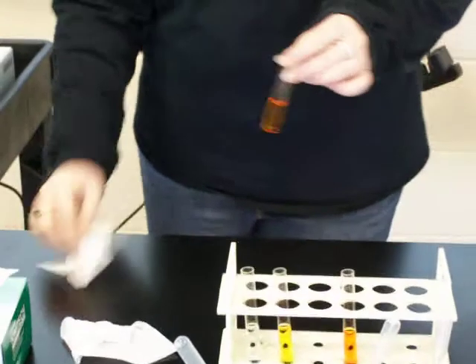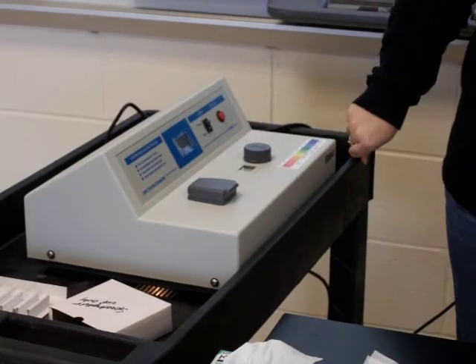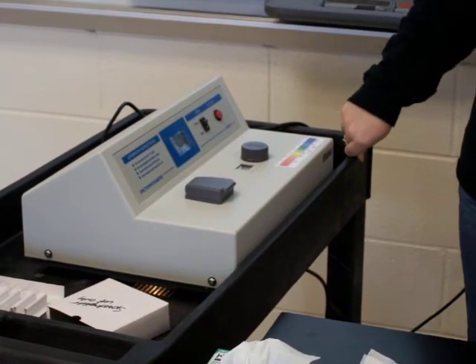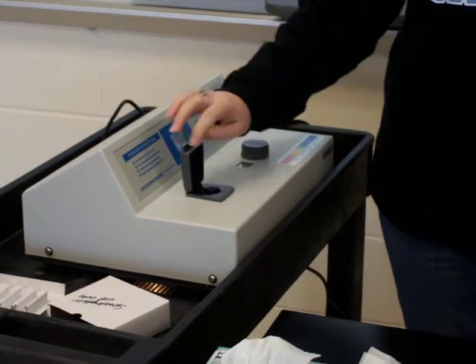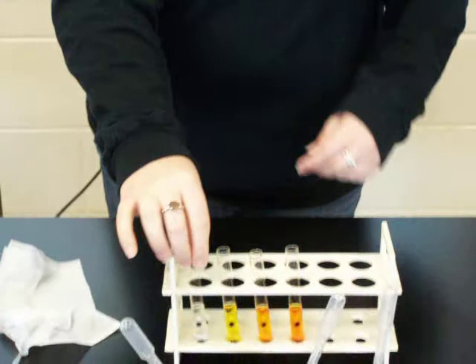Now sample B. Sample B has an absorbance of 0.42. I'm going to use the blank again.